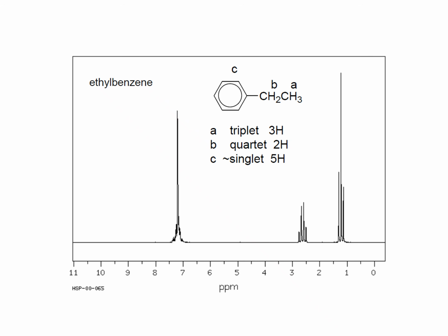Then ethylbenzene. All of that will have one environment, these will have one environment, and it will have another environment. So A, B, C. So how will I arrange them? Always the benzene would be C and its location would be at 7. Okay, very good. Then CH2, CH3. So which one would be CH2? CH2 would be B. As it is near to the benzene, its location would be like that, and the remaining one is A. Now look at their height.